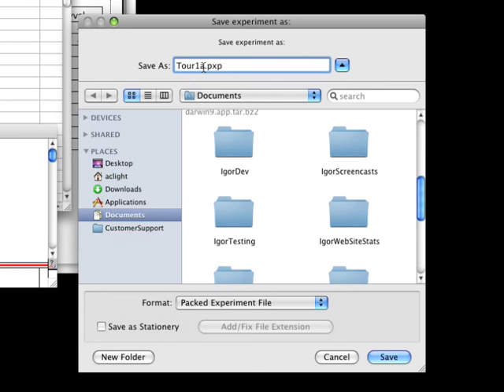Before saving, it's important to pick an appropriate folder to save the data in. You should never save your data within the Igor Pro folder, because doing so makes it much more difficult to update Igor and make backups of your data. A good place to save your data is in your Documents folder.